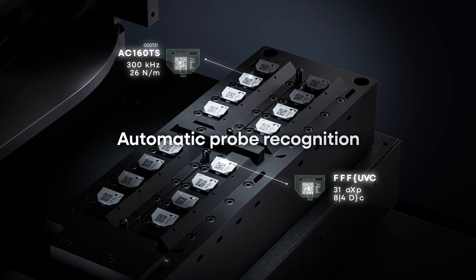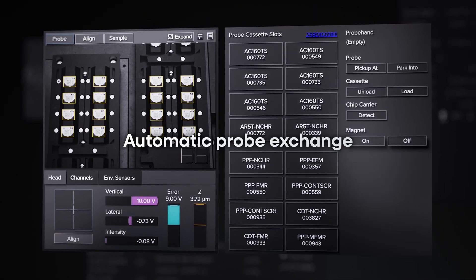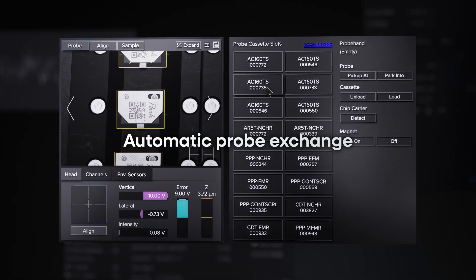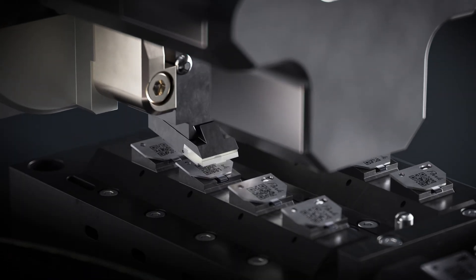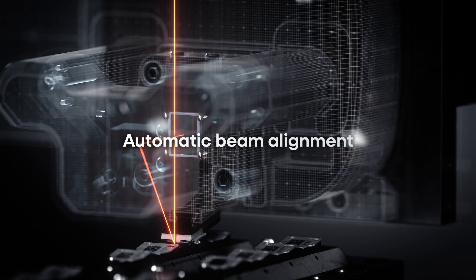The FX200 simplifies AFM operation with automation, a built-in camera, and QR code system verified probe status. Automatic probe exchange selects from 16 slots, while machine learning aligns the laser beam and photo detector.